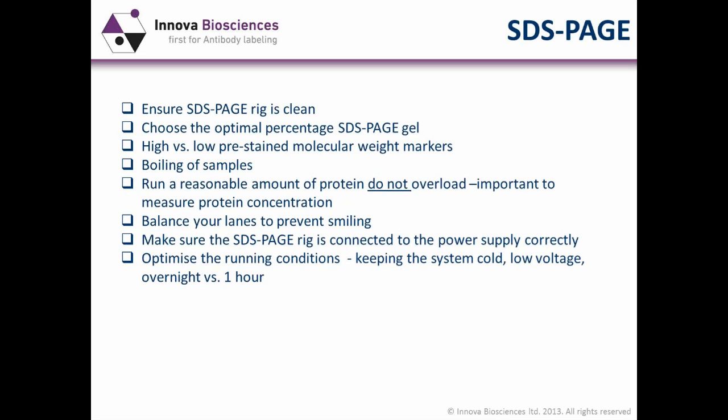I found, based upon my own experience and my own troubleshooting, that if you put samples in SDS loading buffer and then don't boil them immediately, it can actually cause the proteins to degrade significantly. I can't quite understand why that should be the case, but from my own experience, I've proven this time after time.